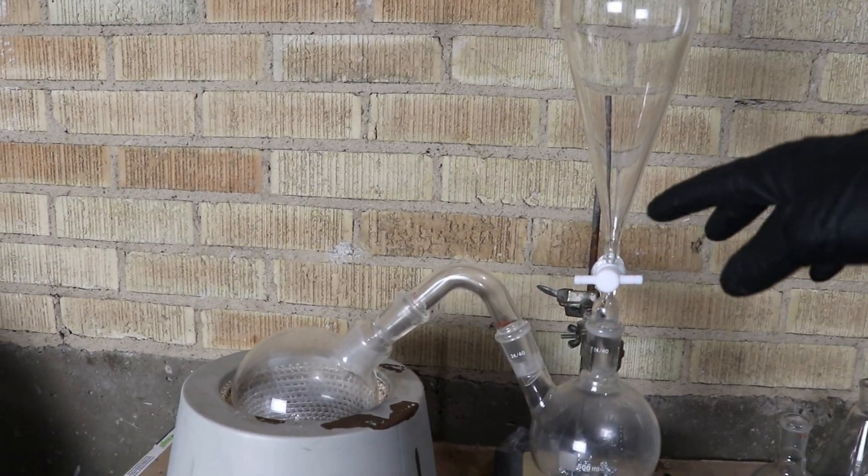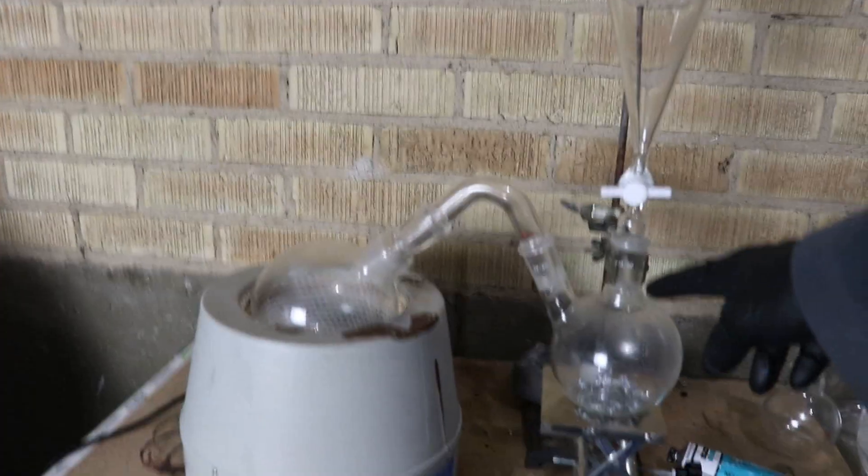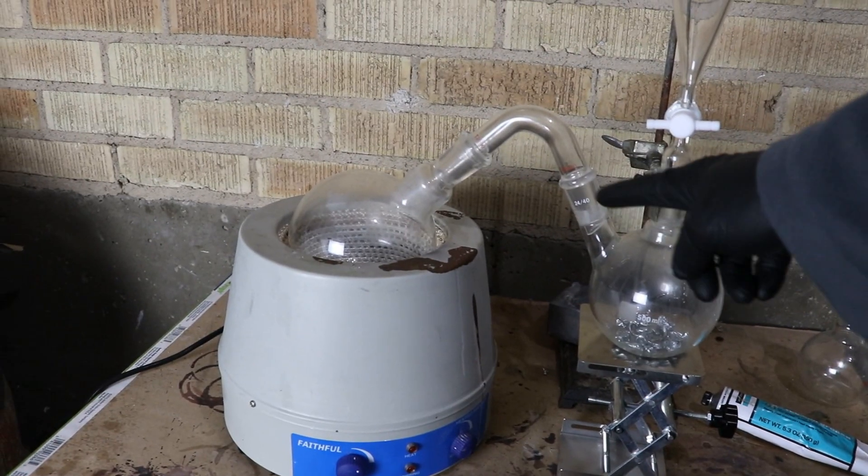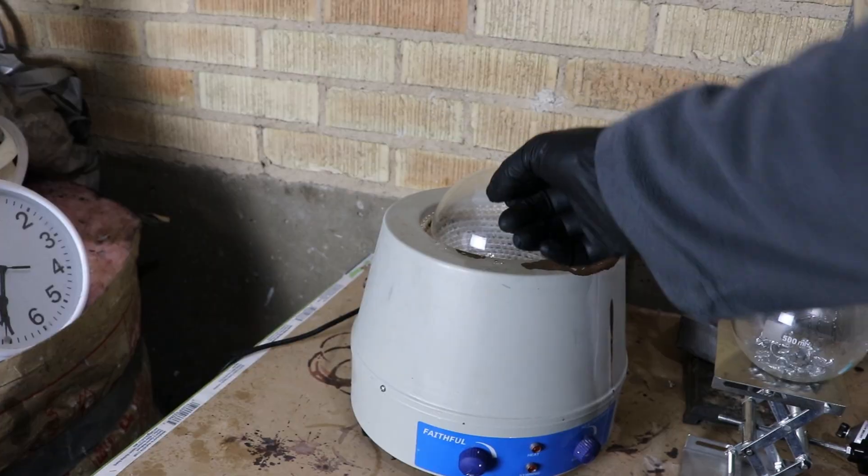The first shipment just came in and I've got this separatory funnel, this two-necked flask, a little elbow, and I already had this.